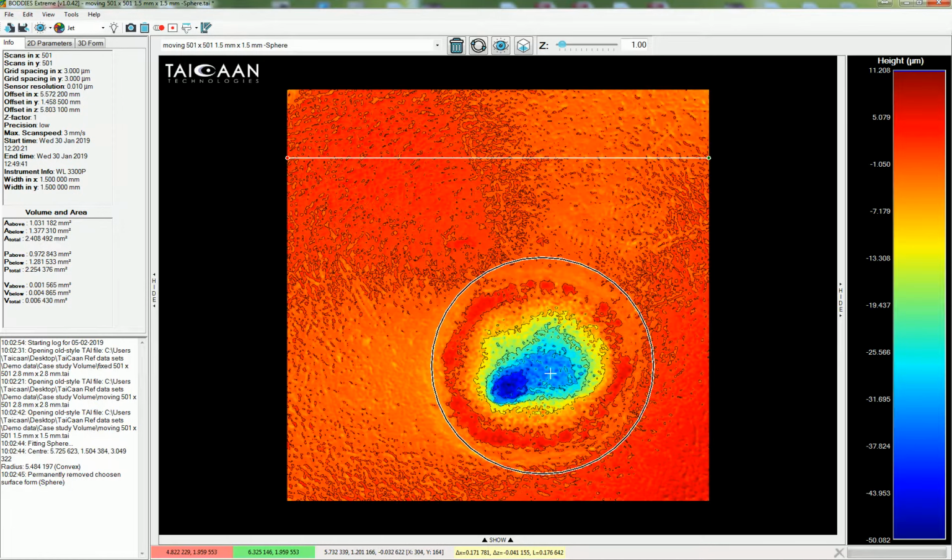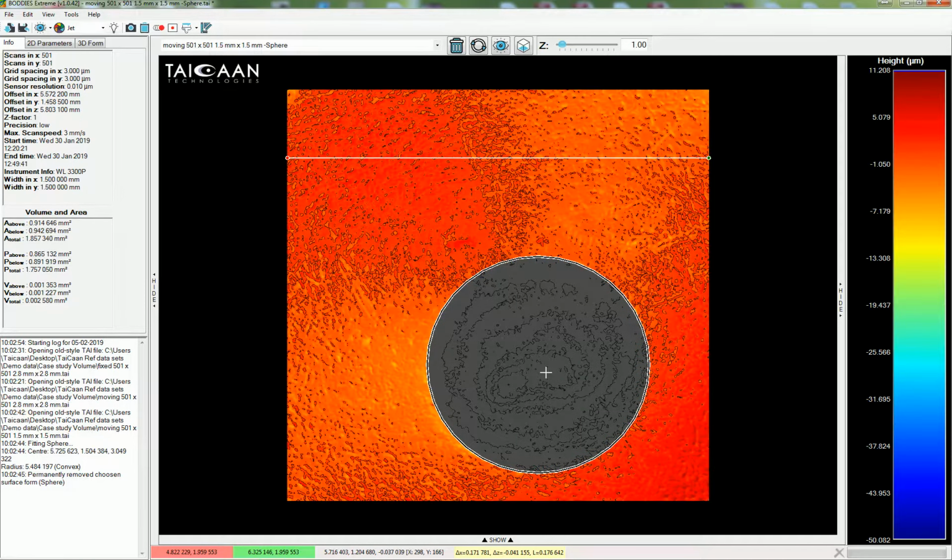And you can see I have a position here where I've drawn a circle which is just outside of the crater, where I've got the higher red colours shown here. I'm just pointing to that, and then there's an orange ring beyond that. So I'm just going to draw this just around the orange ring on the outer ring, and I'm going to remove it.